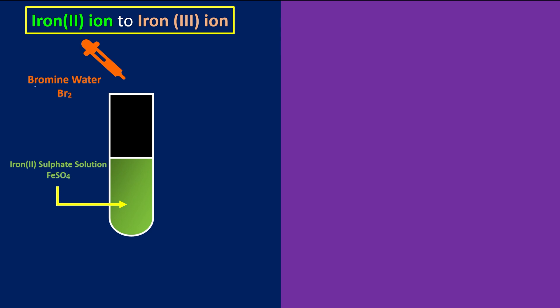And don't forget, when we have the halogen in the molecule form, they are oxidizing agents. When they're in the halide form, they are eventually the reducing agent. So now we're going to add in our bromine water drop by drop, and we can observe the color changes.